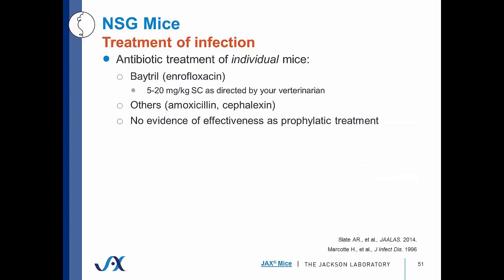If you do have NSG mice that are infected with a pathogen, we do have some recommendations, but we highly recommend that you speak to your veterinarian and get their input. We have successfully used antibiotic treatment to treat individual mice, including using Baytril or enrofloxacin subcutaneously.